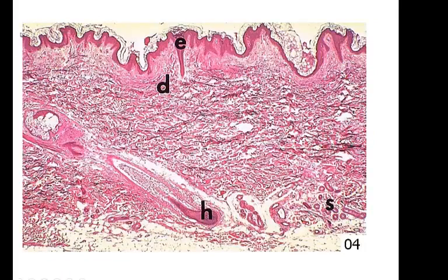This is skin. Up here we have the epidermis. This is keratinized, stratified, squamous epithelium, if you've already reviewed the epithelial slide.